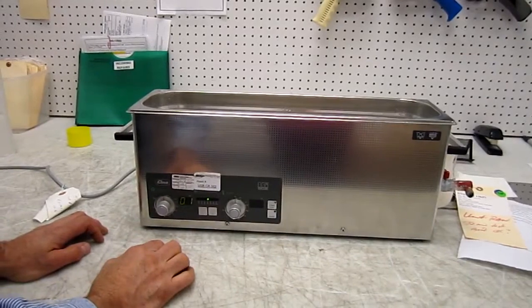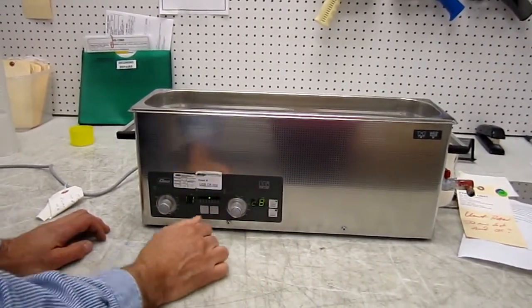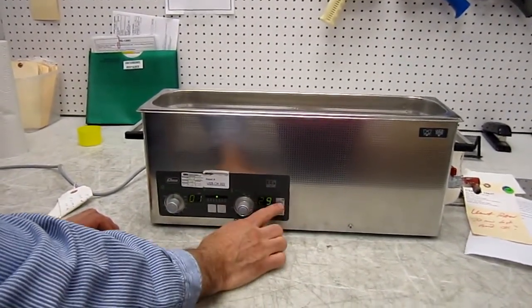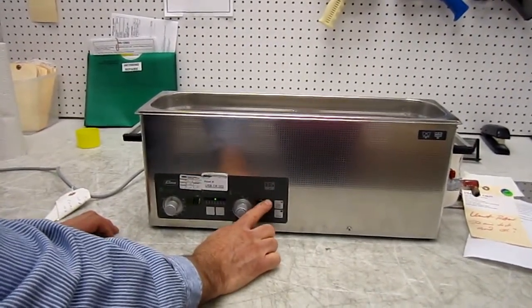Heat control is almost identical to it. You put this into the heat control here and then hit start and the heat comes on. Now it will maintain 29 degrees, and this is in Celsius.